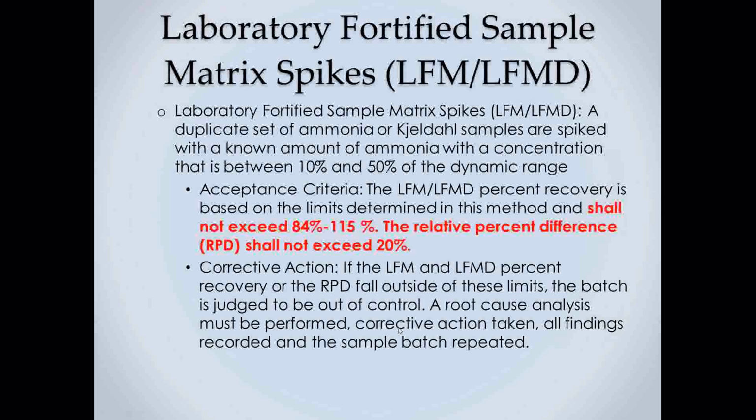Ongoing demonstration of capability. We're allowing you to set control charts on ODC. Your IDC is a calculation, and you get an RSD, you get a percent or an average recovery, all right? Your ongoing demonstration of capability, your LFB as you're running each batch, has to fall within the control chart limits, okay?